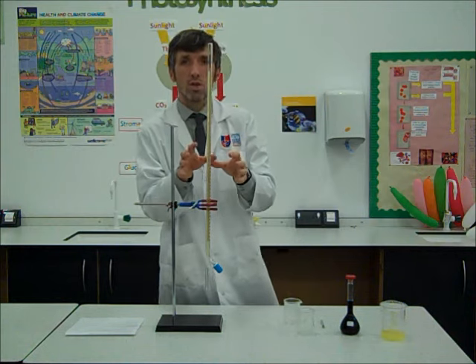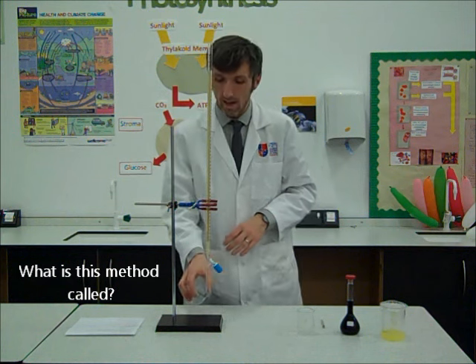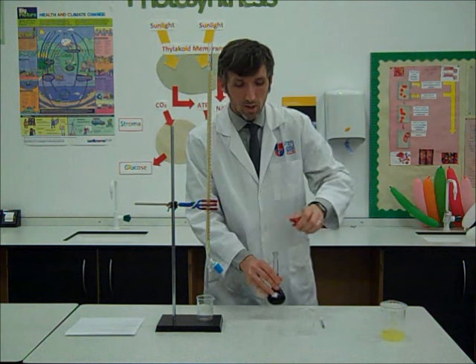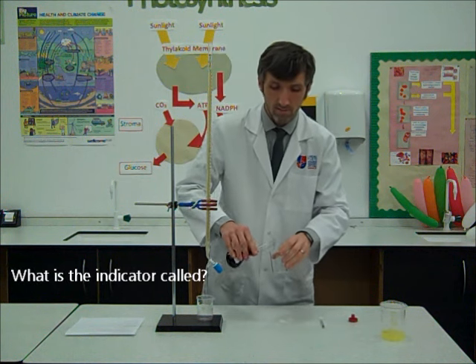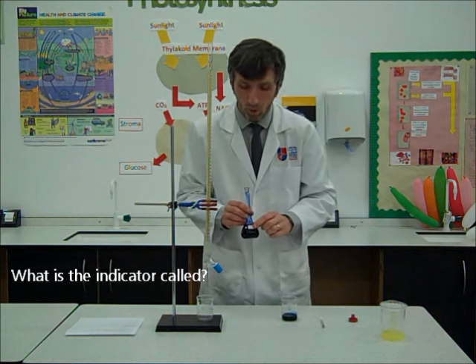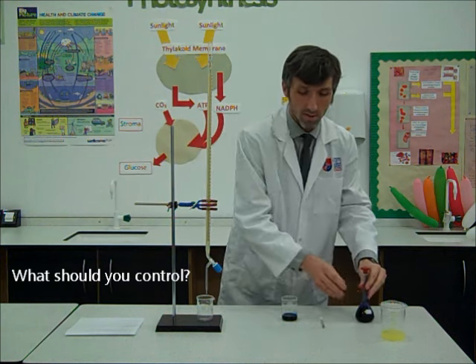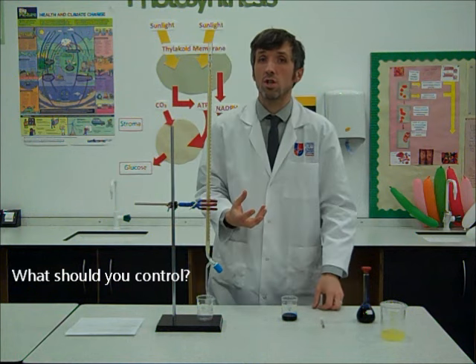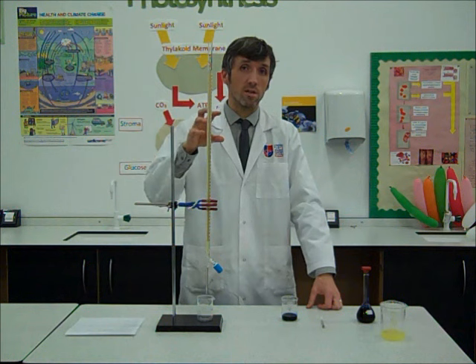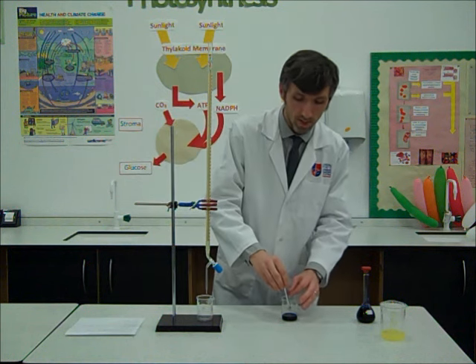We're going to titrate the juice into DC-PIP, which is going to be our indicator of the amount of vitamin C we've added. In order to make sure this is valid, we're going to use the same concentration of DC-PIP. This is 0.1% DC-PIP solution, and we're going to use the same volume, because obviously if we change the concentration or we change the volume of DC-PIP, then we'll have to change the amount of vitamin C that we add, and so the results will not be reliable.